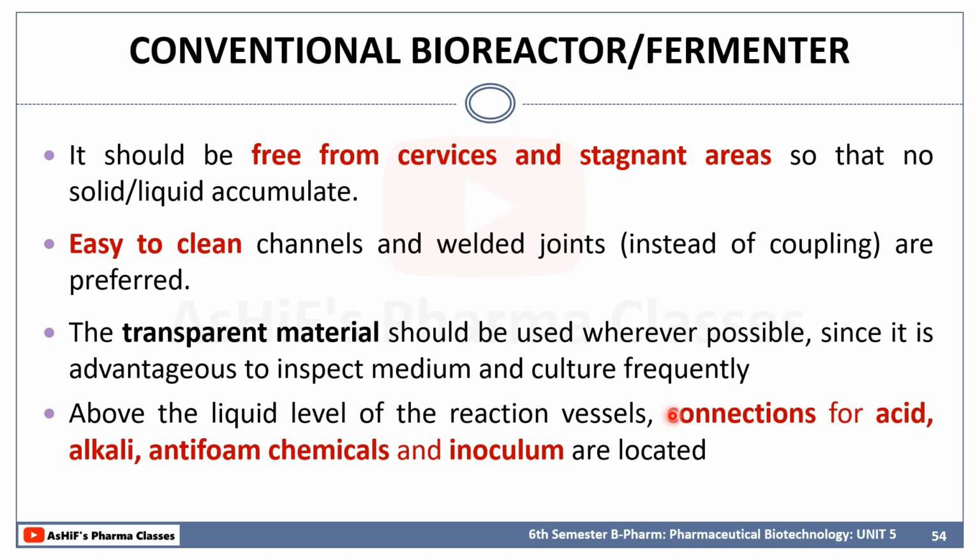There are some other properties that must be followed for a conventional reactor. While designing a fermenter, we have to design it in such a way that it should be free from crevices and stagnant areas. That's why I mentioned it should be dome shaped.